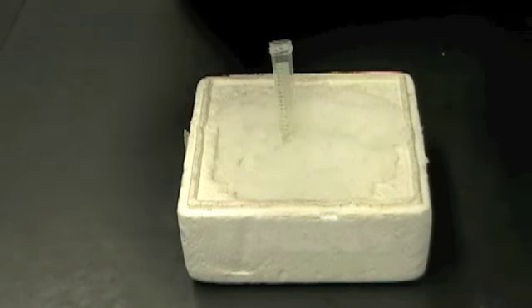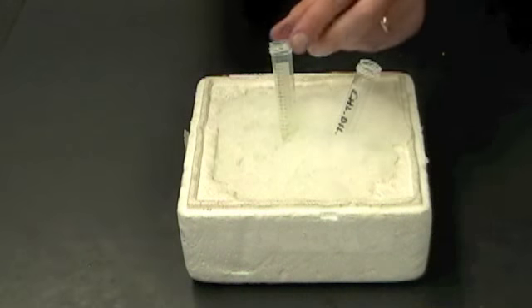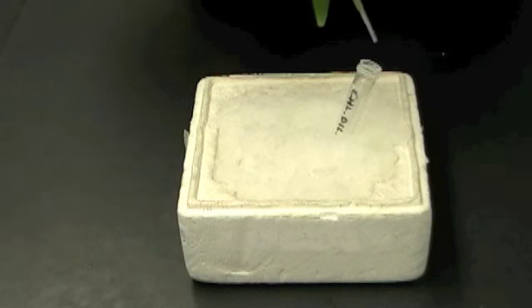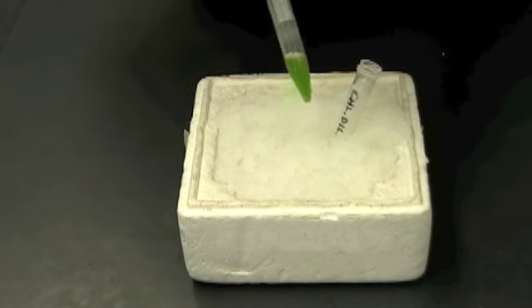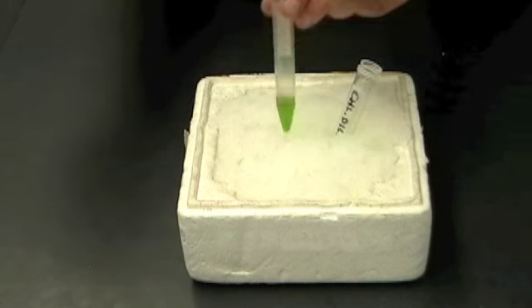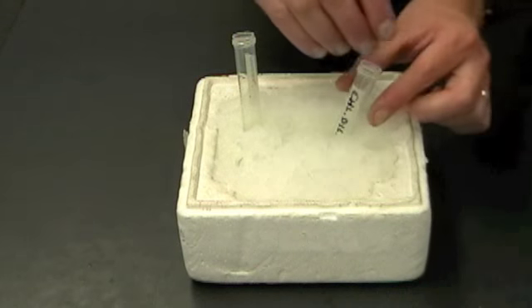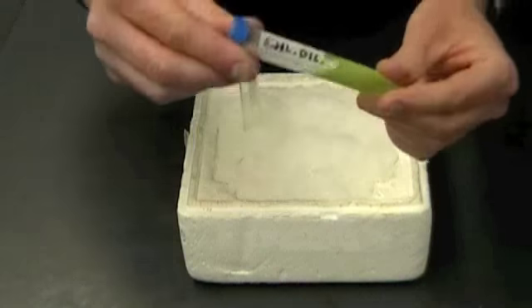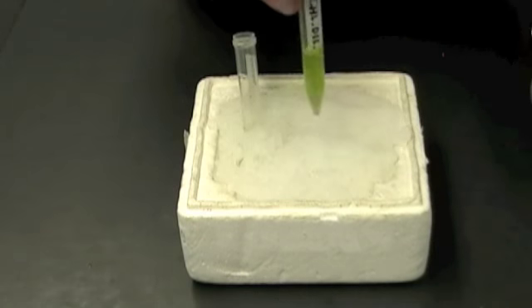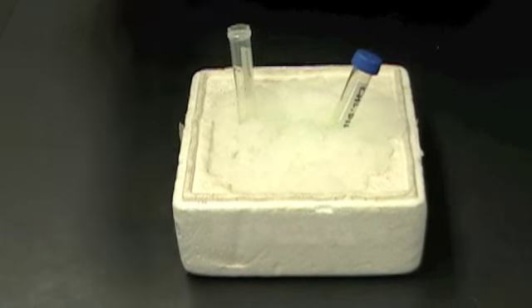Now I've already got 5 mils of the grinding buffer in here, and then I'm going to add to that 1.5 mils of this chloroplast containing solution here. There's 1 and a half. Now this I'm done with. I can put this away, and this chloroplast dilution is what I'm going to use in the rest of the experiments. So definitely I'm going to want to leave this on ice to keep the chloroplast happy. We like happy chloroplasts, don't we?